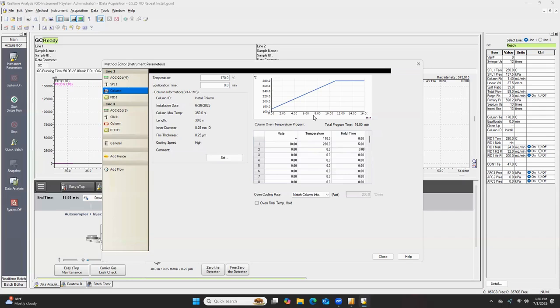The first segment of the curve was a gradual increase in temperature. Yes. Then the second one is fixed. So how do you set this, how to make the increase gradual? Oh, by inputting these parameters right here, so by changing the rate. So the rate is how fast or slow. The first row has no rate, so for that reason it was not increasing gradually.